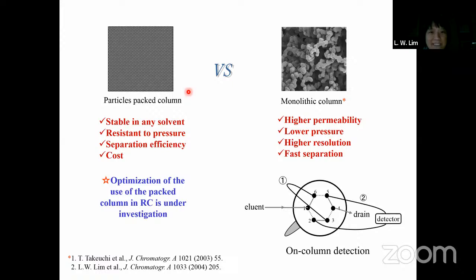Please try. Satria. Good afternoon. I am SDF from chemistry again. Why during the chromatography process should there be no air bubble in the system, and how to choose the mobile phase for the fluorescent detector, because it's very sensitive, and so on.